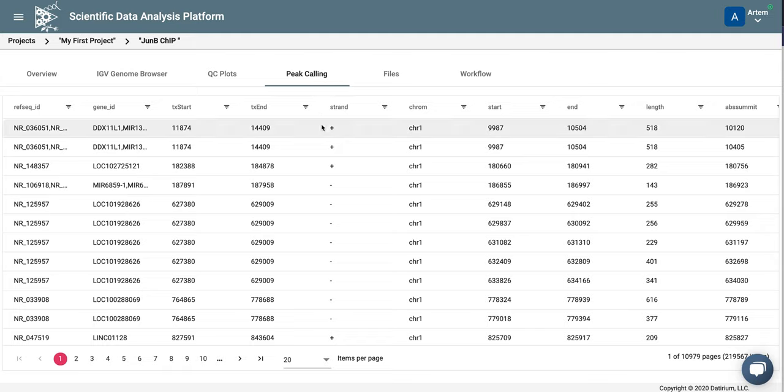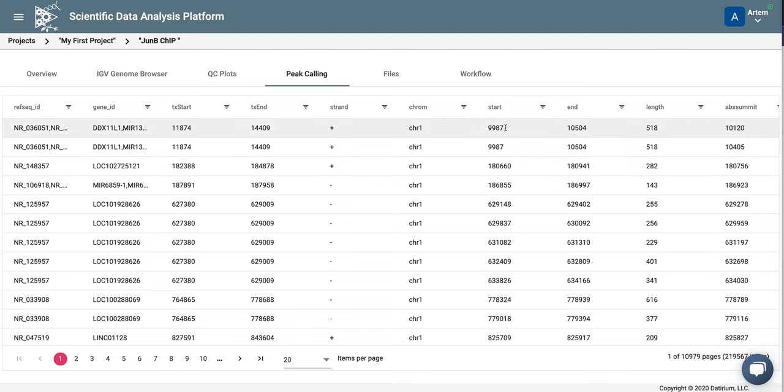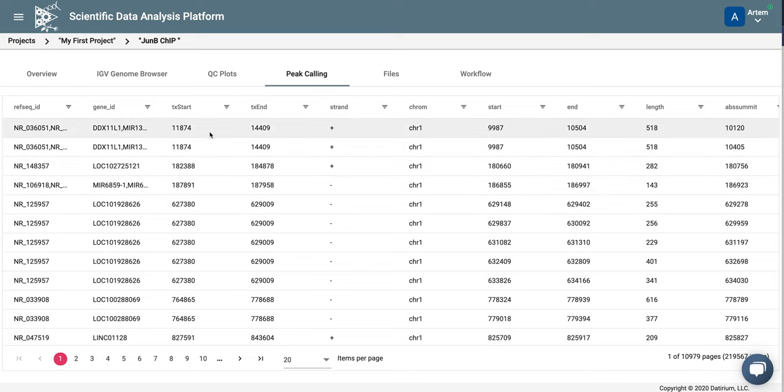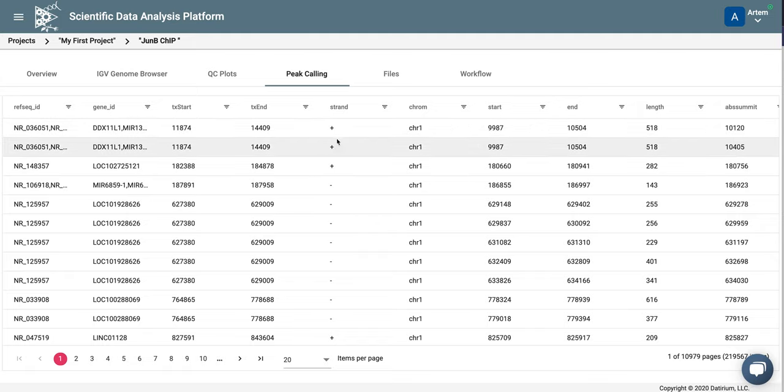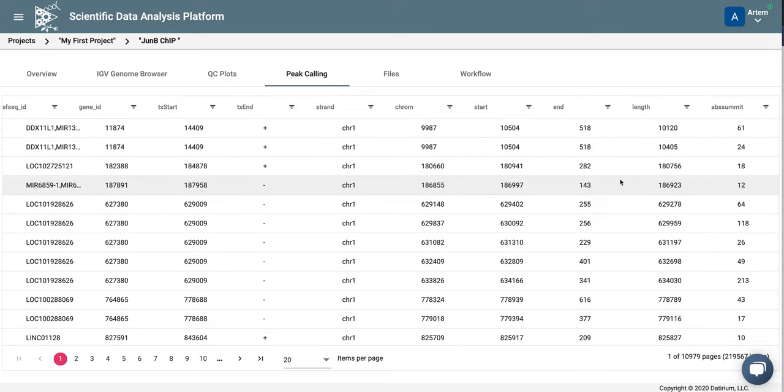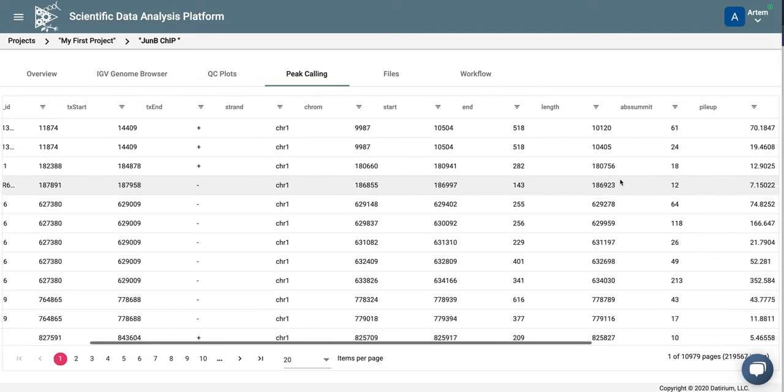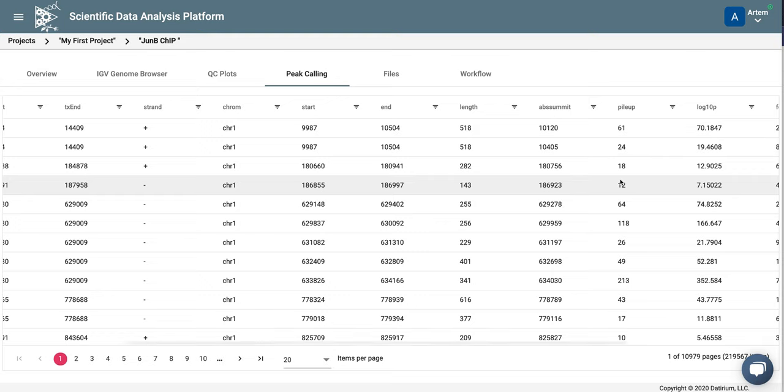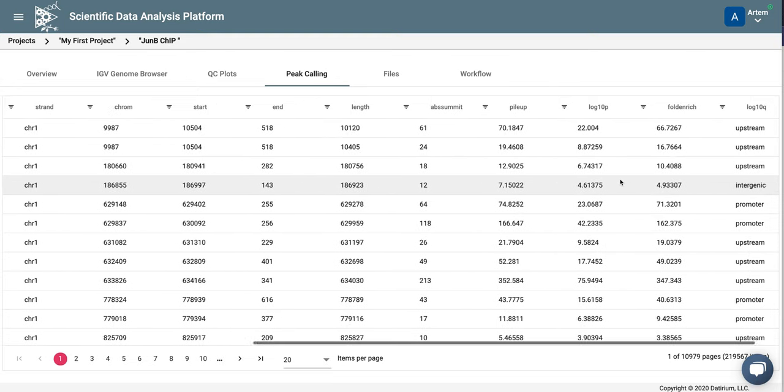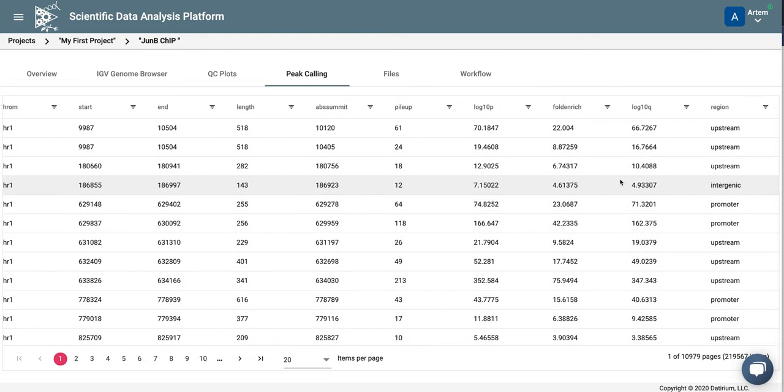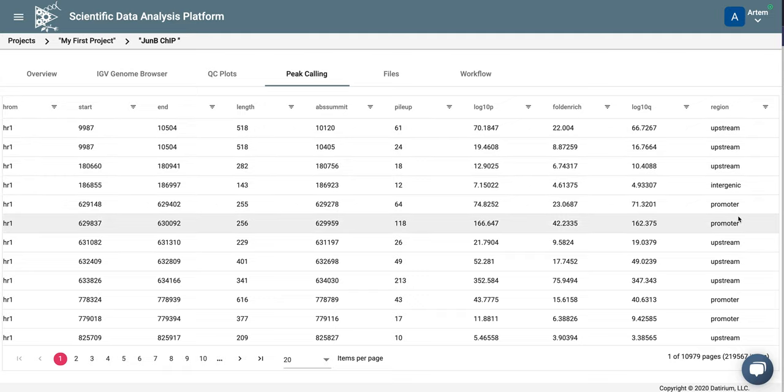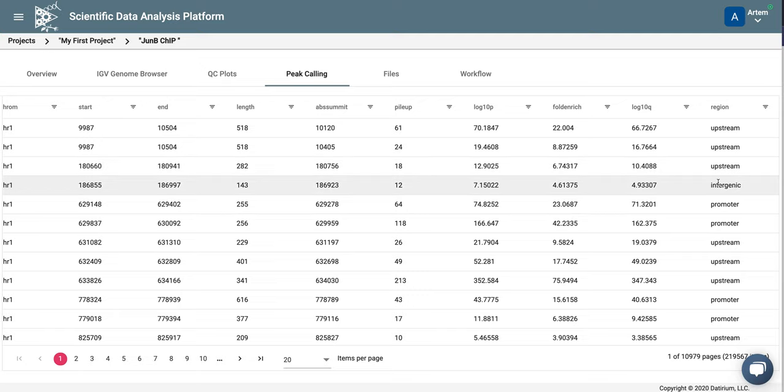Here in this table, you can see the peak coordinates in the middle. So this is chromosome start and end of the peak. On the left, you can see what are the nearest genes to the peak. And you get both RefSeq ID, gene name, and gene start and end of the strand. You can also see peak characteristics such as the length, summit, p-value, pileup, q-value, and also where it is located relative to the gene. It can be promoter, intergenic, upstream, and so on.